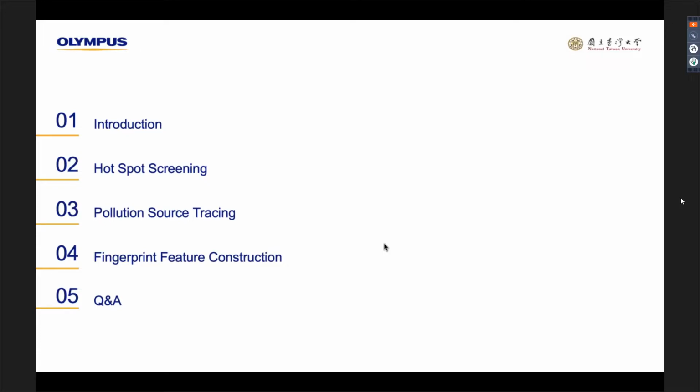Today's agenda will be as follows. I will briefly go through the introduction, whereby I will explain a little bit about the theoretical part of XRF. Then Professor Chang will continue and discuss more about the hotspot screening, pollution source tracing, and lastly, fingerprint feature construction. And at the end of the webinar, we will have some Q&A.